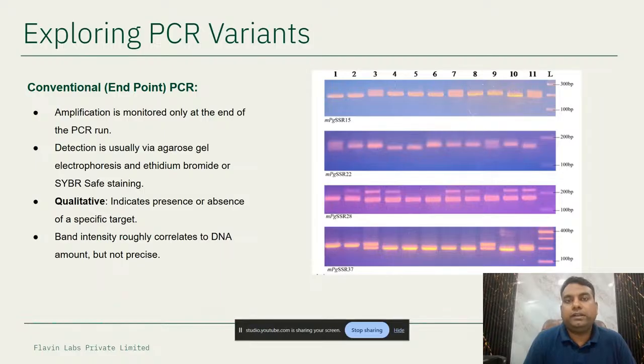It is not quantitative. Qualitative means that you are going to judge on the basis of what you can see or observe with your eyes, not in terms of numbers. For example, in the image which I have pasted, some have single bands, some have double bands, some have sharper bands and some have a little fuzzy or less intense band.